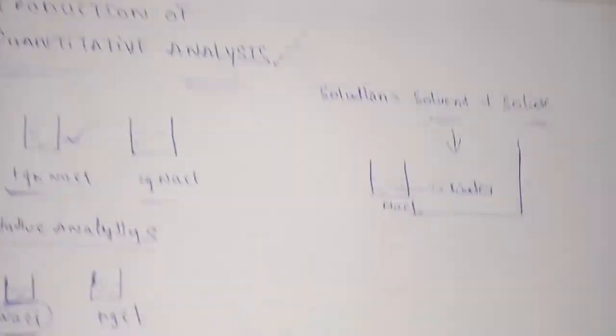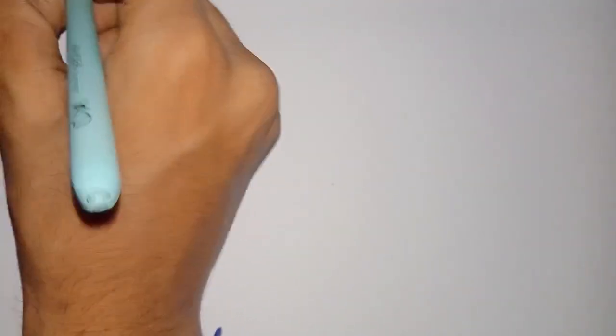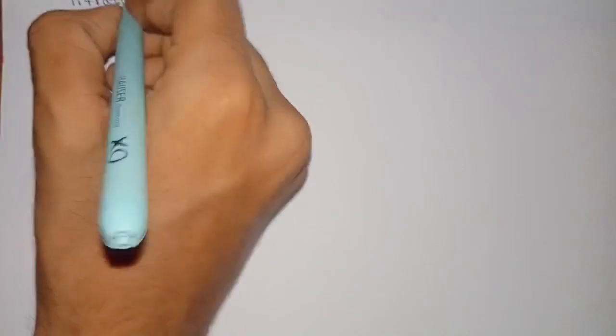So now we are going to learn what titration is. Titration means not only an experiment.